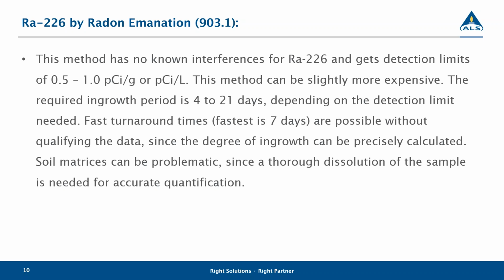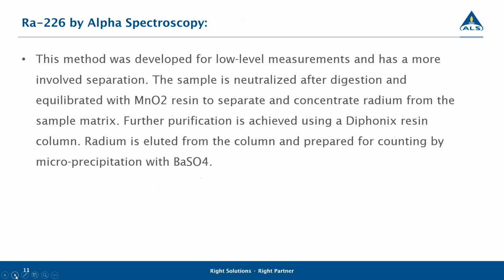Soils can be a bit problematic for this, even though we have modified the method to be able to do soils. The key to this is getting a thorough dissolution on the soil to make sure you get everything in there. So in order to do that, we actually do an HF digestion for it to ensure that we're getting a total dissolution of the soils.